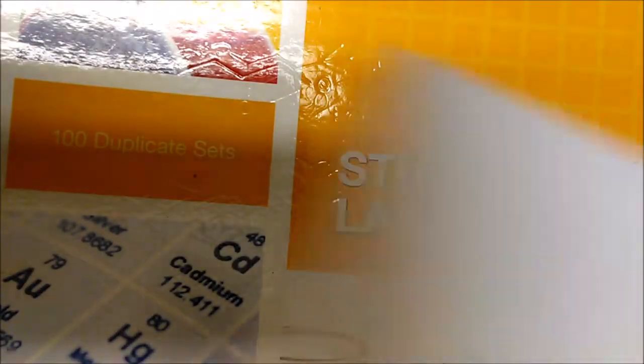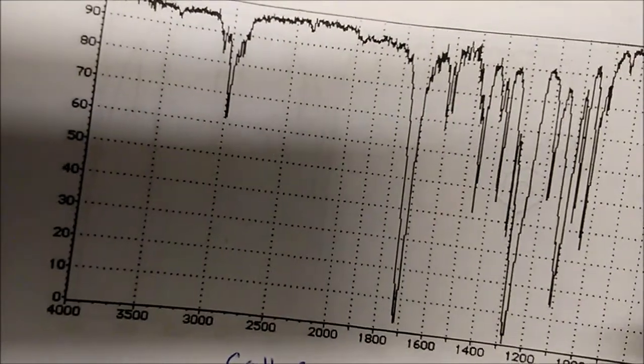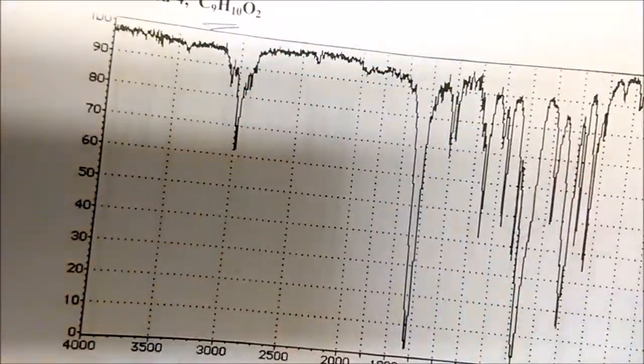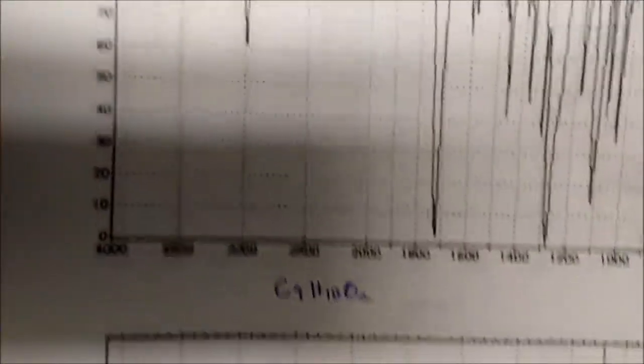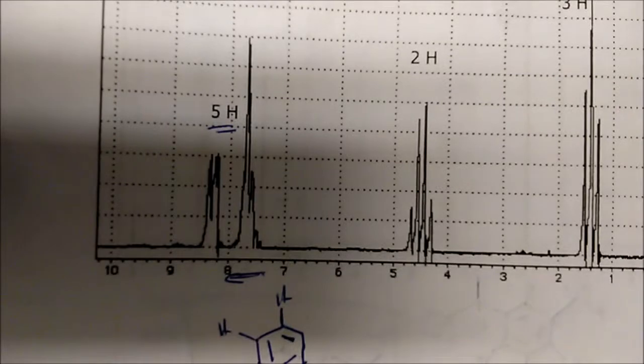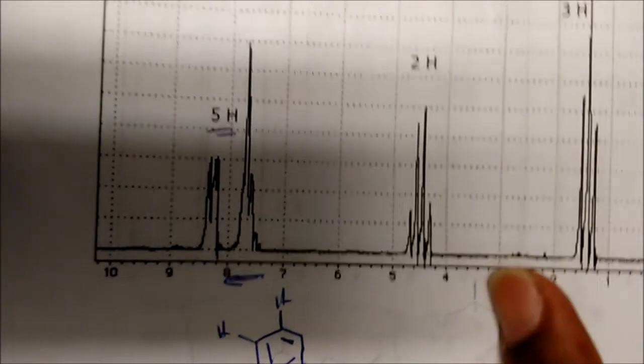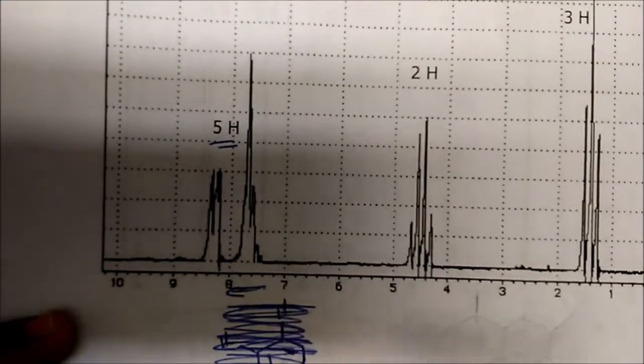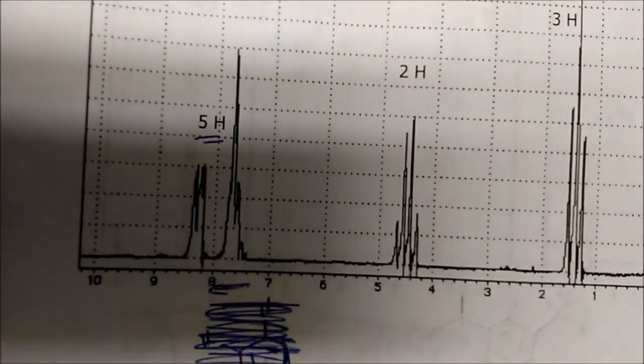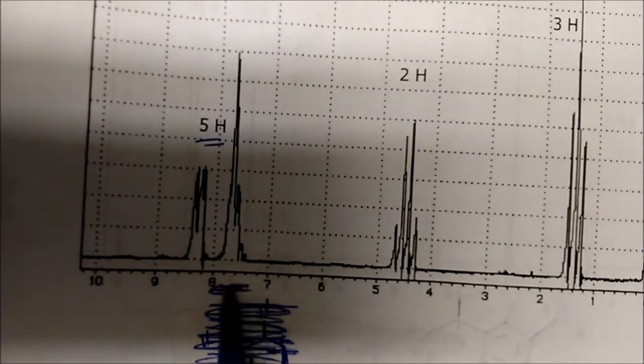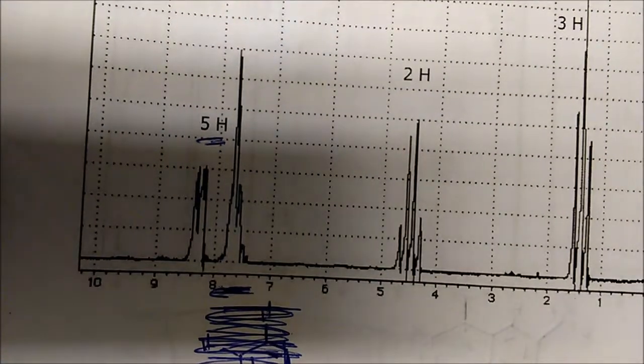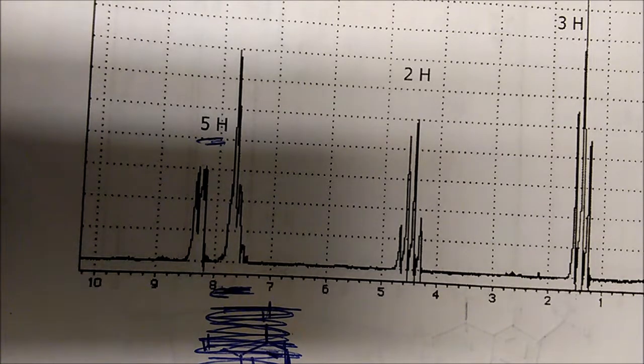Let's try a couple more. Let's take a look at this particular molecule here. It has a formula C9H10O2. This is the IR spectrum. Again, we don't really care about the IR spectrum. We want to just be able to identify molecular formulas just from NMR graphs. I kind of wrote on this a little bit, but let's kind of mark it out and start fresh. So let's take a look at the graph. We see that we have some sort of chemical shift here around seven to eight with an integration of five. And remember I said that usually when you see chemical shifts and peaks around seven to eight parts per million, that's usually an aromatic ring.